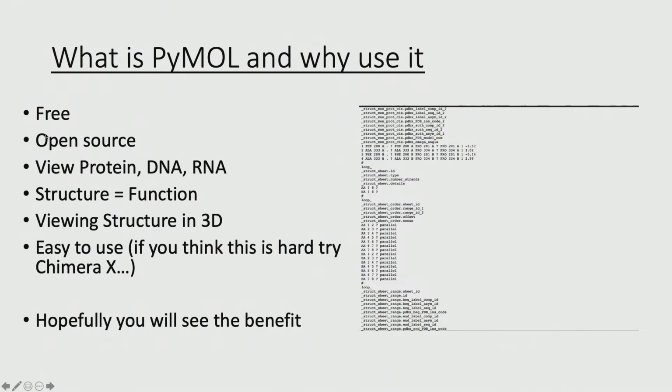It's constantly being developed. You can use this on either Mac or Windows, and the current versions of Mac and Windows. You can view any sort of protein, DNA or RNA. It's easy to use. It has quite a lot of tools, so it's more difficult to use than something like RasMol, but RasMol has not been updated for a very long time. So PyMOL is up to date, which means they've made it simpler.